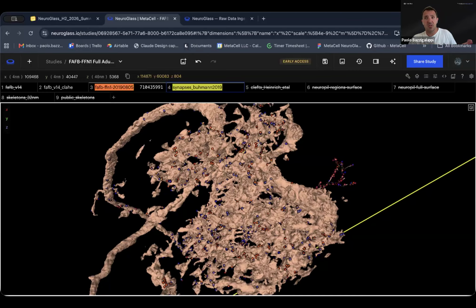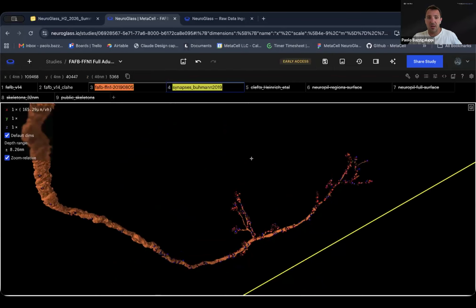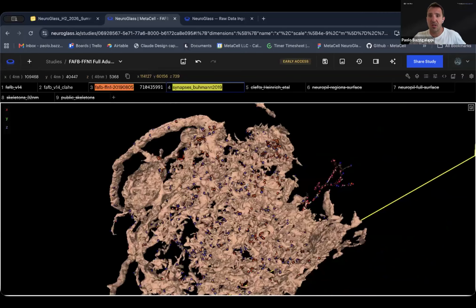As I described earlier, there will be workflows that allow people to edit and comment on other people's annotations. This is all to make the everyday workflow of researchers more and more collaborative, intuitive and usable.